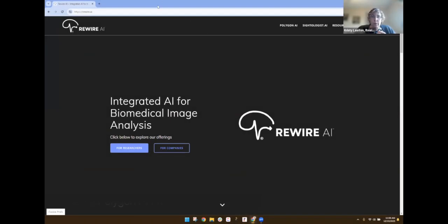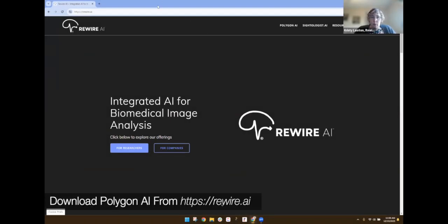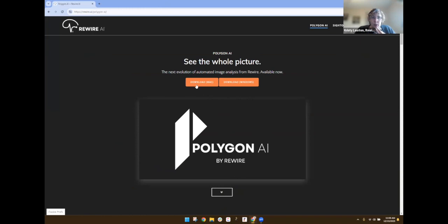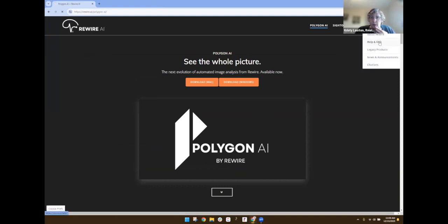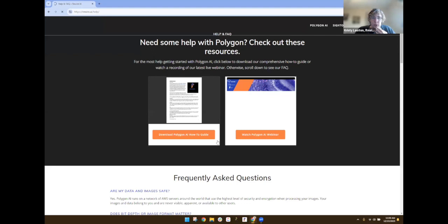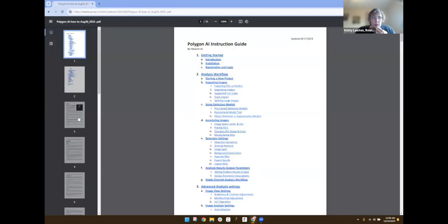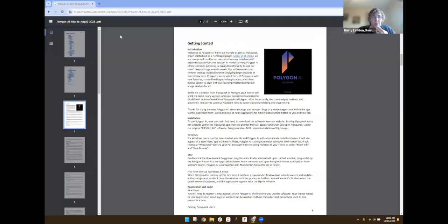All right, so the first step, if you haven't already done this, is to visit our website, rewire.ai. If you go to Polygon AI, you'll see that we have downloads for both Windows and Mac. The download and installation process is pretty standard and straightforward, but if you do need any help, we have some resources on our help and FAQ page with more detailed instructions. In this how-to guide, you'll find instructions for installation.